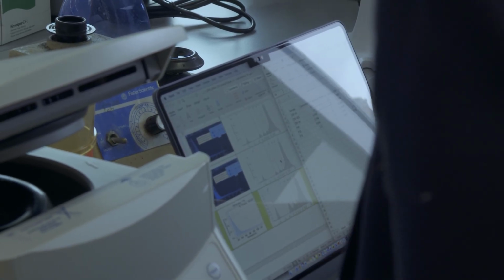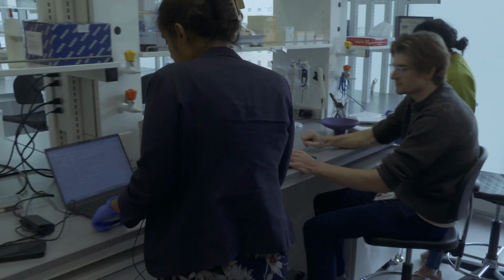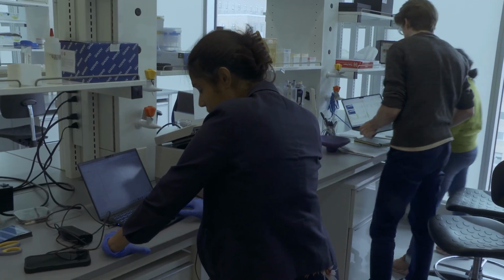So the first step would be the end repair, right? Let's do it so I remember every step. I think we are going to lose some samples because it has purification. So these are all lossy steps. Let's start working on it because it's a really long incubation.